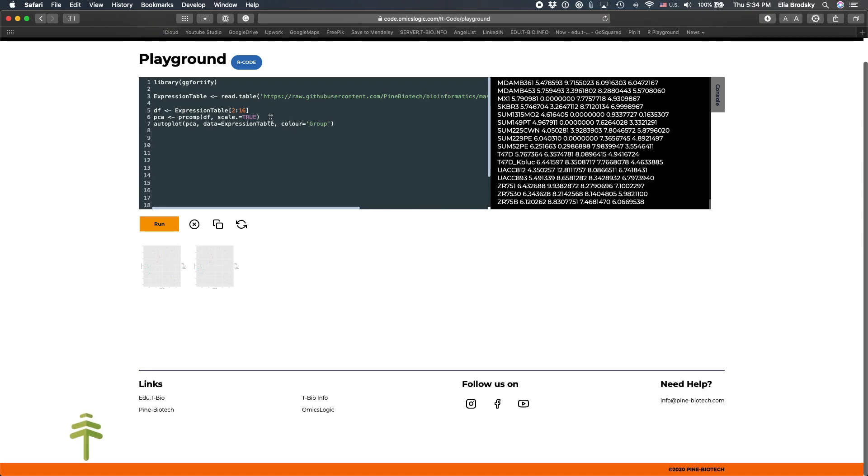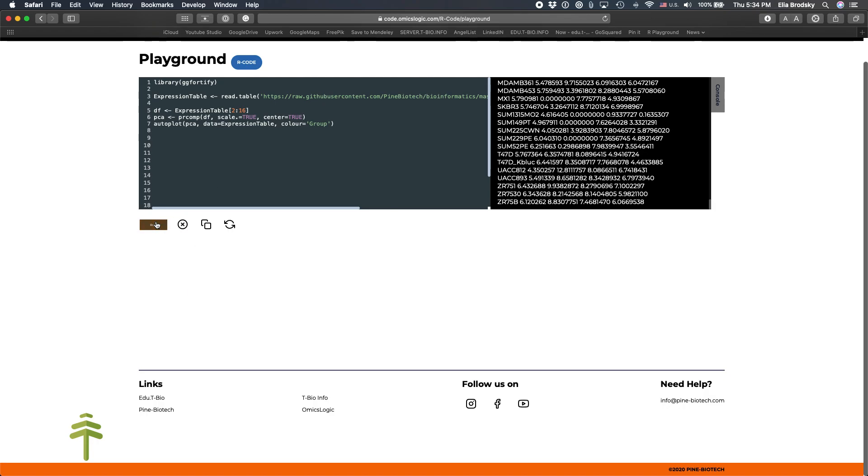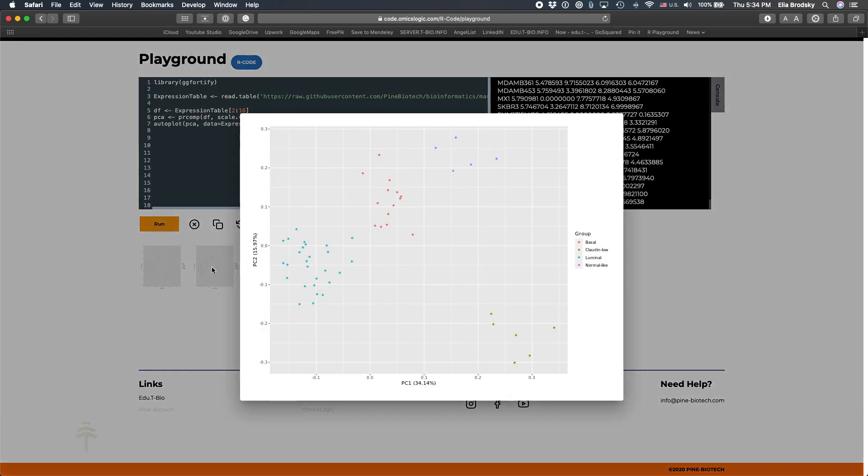We can also center. It doesn't really change much, but the plot moved a little bit. So everything now is more aligned to the center of this chart. So this scatterplot now is centered around this 0, 0 position.